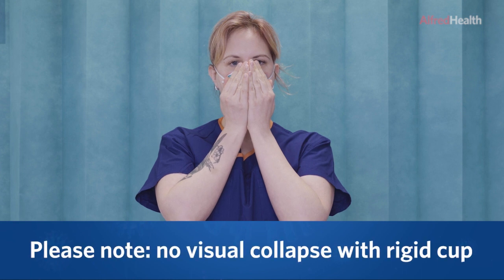Please note, there is no visual collapse and expansion with this mask.